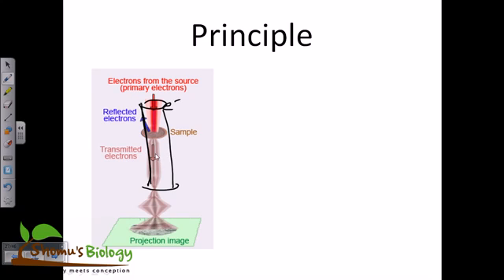But the idea here in TEM is that the electron should have a much higher speed than in the case of SEM, because in a scanning electron microscope a particular speed of electron is required, but in TEM we need much faster electrons, because the faster the electron is, the faster it will pass through the sample, and it can project the image onto the screen. There is a camera, a CCD sensor, that will detect it, and we can visualize that on the monitor screen.